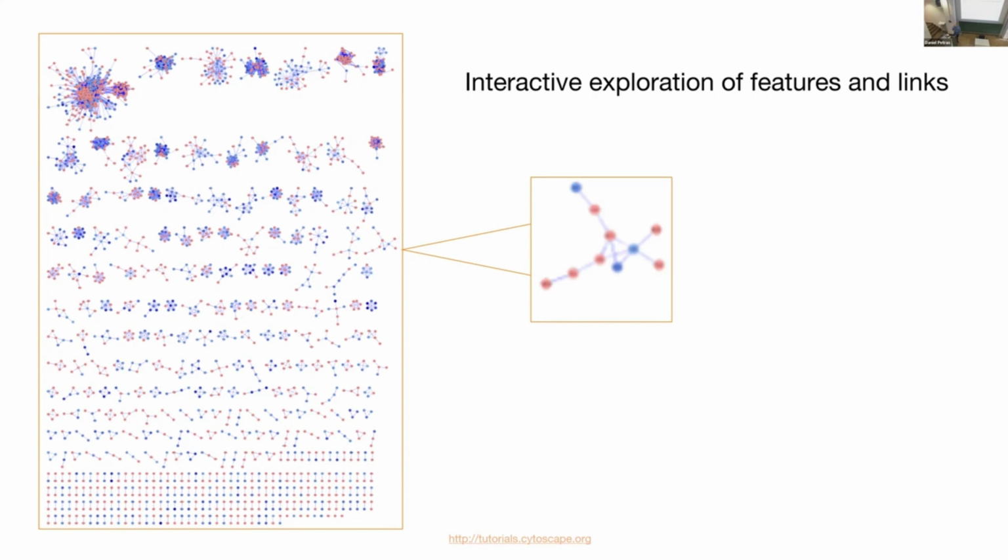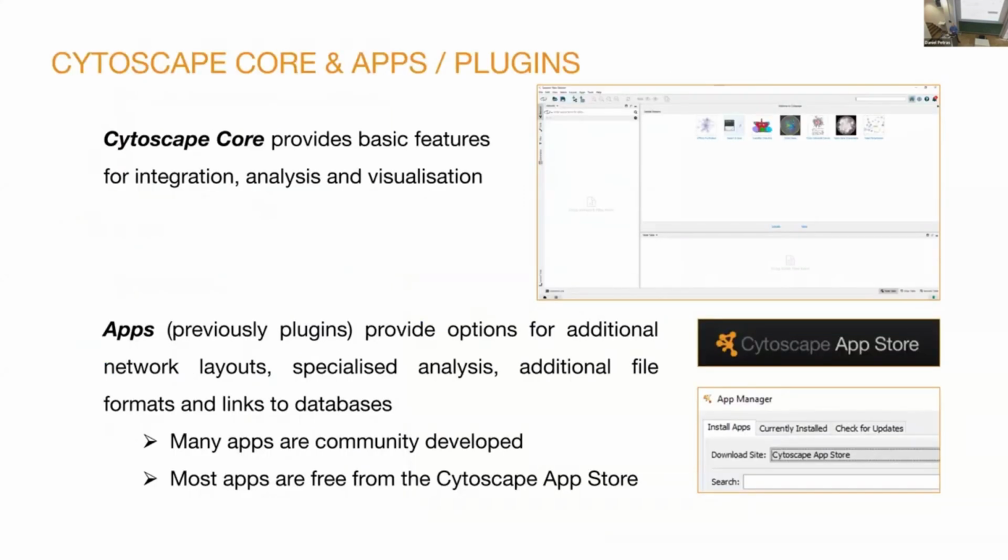Now with GNPS2, there are tons of opportunities in the web browser as well, as Giovanni showed you already, right? So if you want to just have a very quick visualization, you can probably also do a lot of the basic stuff directly in the web browser, but at least, or the latest when it comes to integration of your SIRIUS results, then you cannot do that there anymore. And then, yeah, we would recommend to move on to Cytoscape. All right. So as I mentioned, there's the core app, and then there are the app stores. So you can download different apps. So I, for example, use the ChemViz app, which allows you to display structures directly over your nodes.